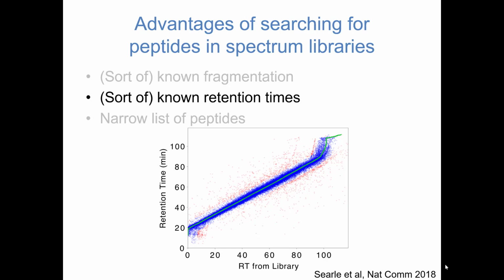And so while this does give you some separation or some discrimination, it's not actually as much as you would expect. It's much more of a nice thing in terms of being able to cut out or call out a lot of the noise rather than improve the amount of signal that you're seeing.